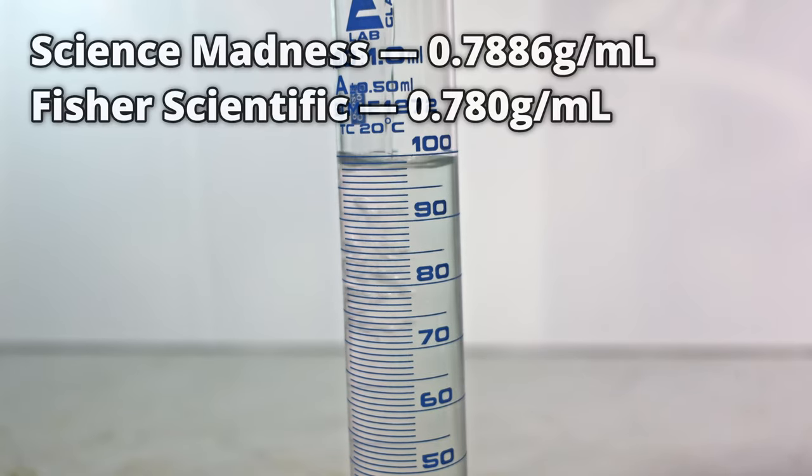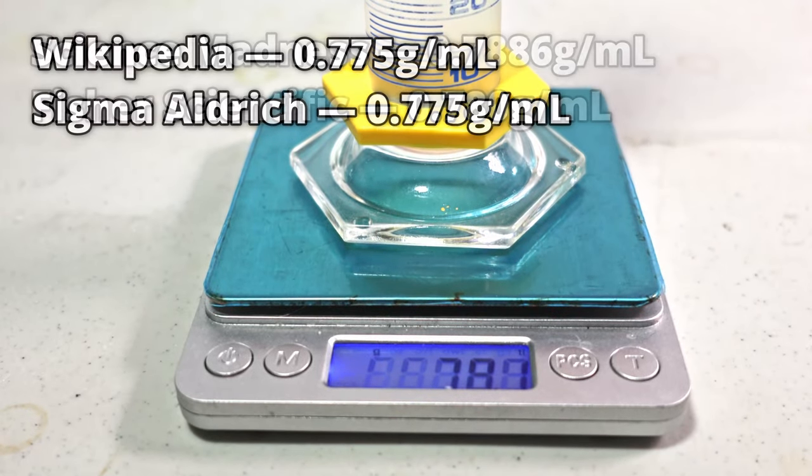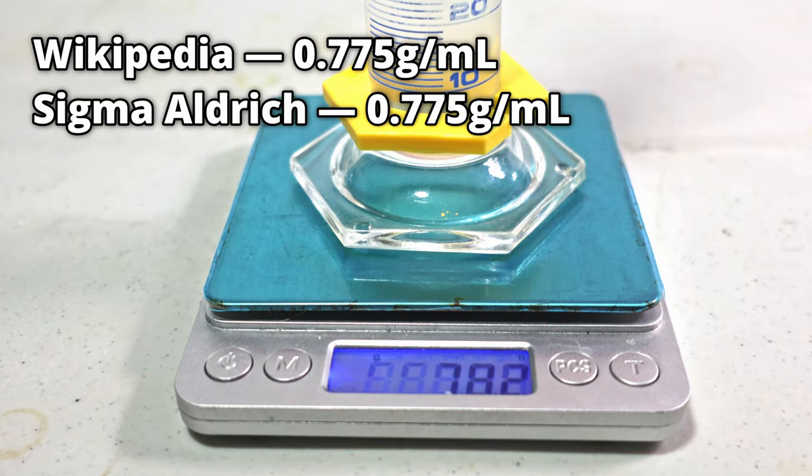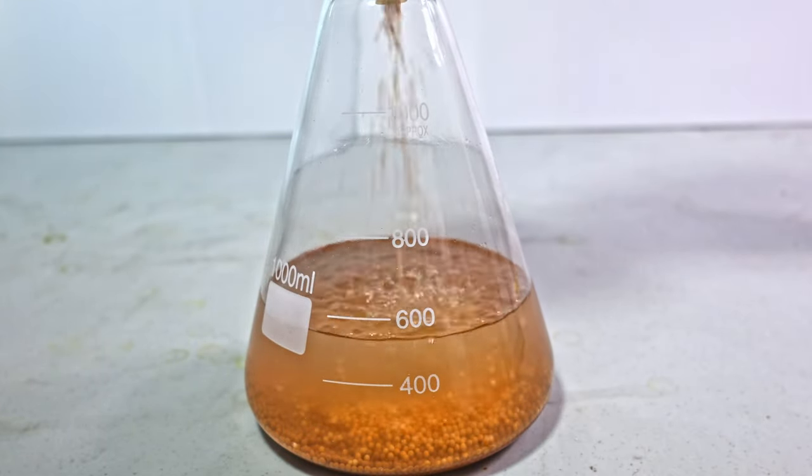Some places like Science Madness and Fisher Scientific say tert-butanol's density is 0.78 grams per milliliter, but other places like Sigma-Aldrich and Wikipedia have it at 0.77. Either way, I'm going to add another 100 milliliters just to make sure there is no more water.